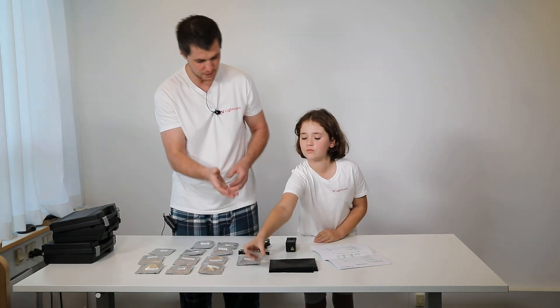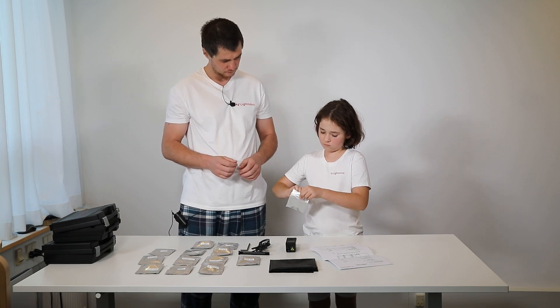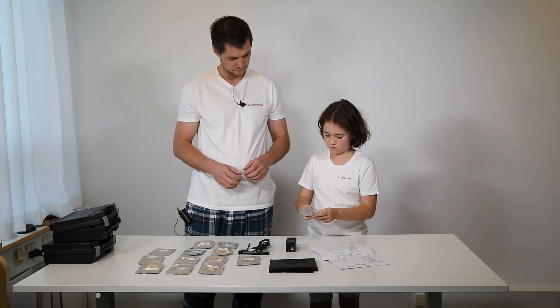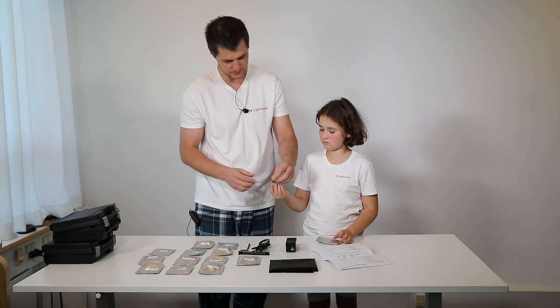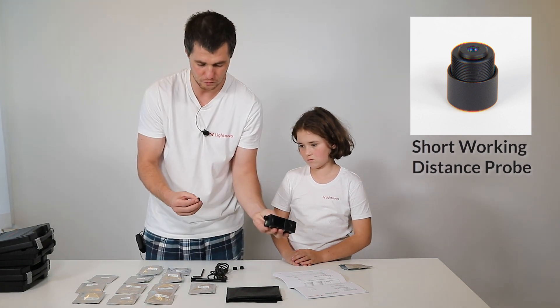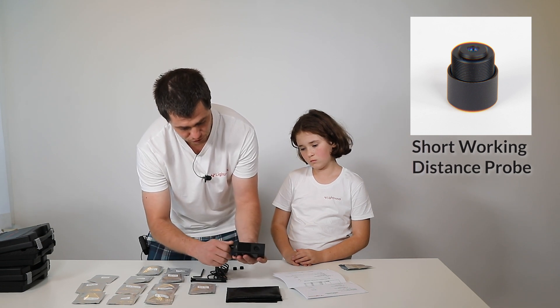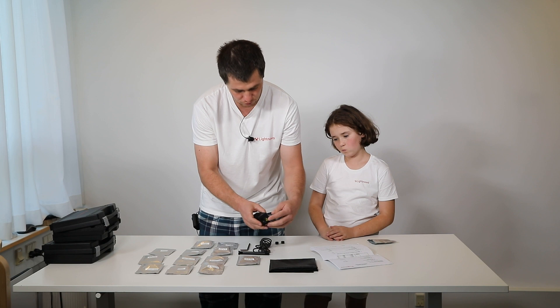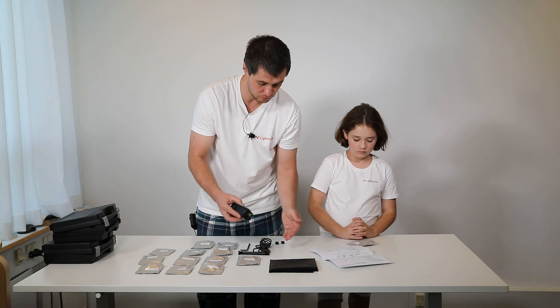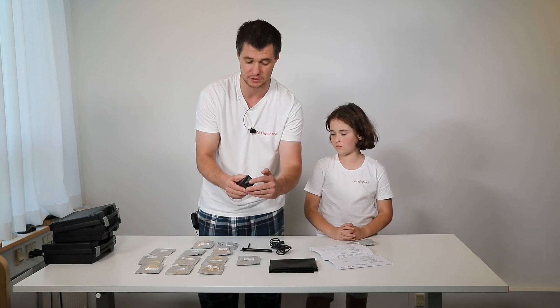Let's start with the probes. This would be the short working distance probe. Basically you have Miniraman and you have the short working distance probe — you screw it here and it's ready to work. The working distance is one millimeter, so you would measure all samples at the focal point one millimeter from the body of the objective.